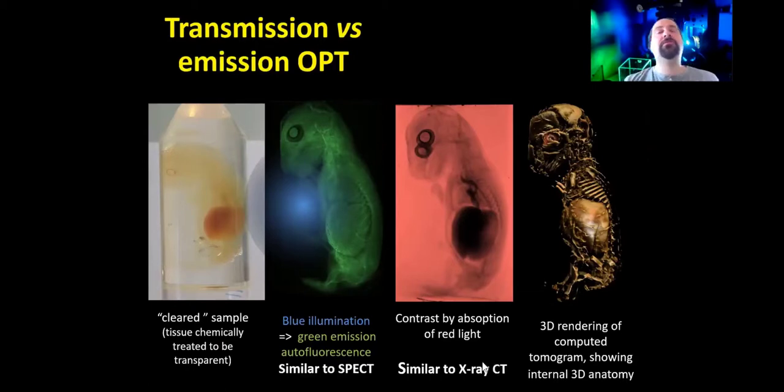Because we normally want to do three-dimensional imaging, on confocal microscopy you cannot do three-dimensional imaging using transmitted light, even though you can image with transmitted light. But in fact, with optical tomography, you can also use transmitted light, as in this example here, and with that, obtain optical slices, compute the optical slices, as long as the sample is transparent enough.